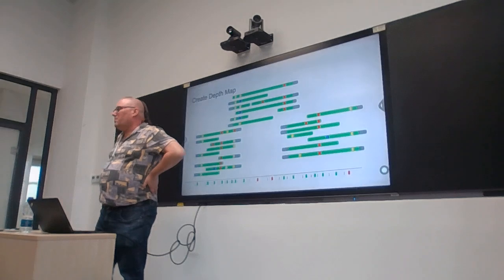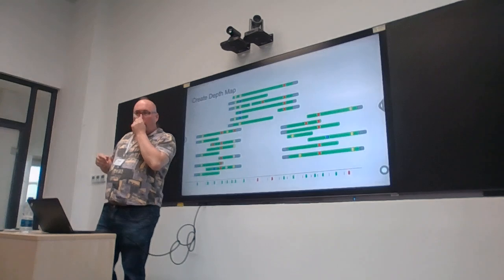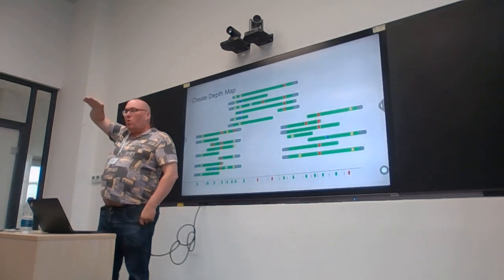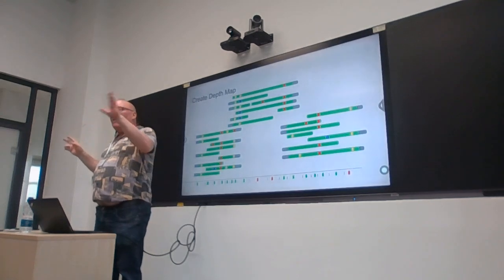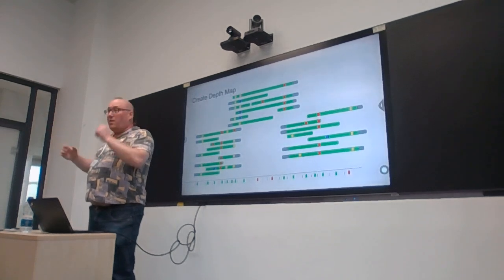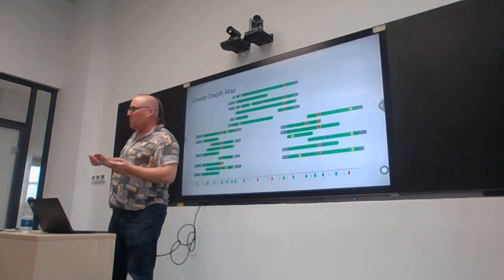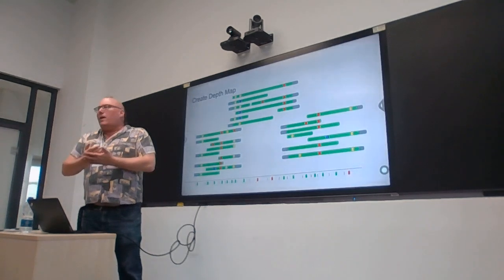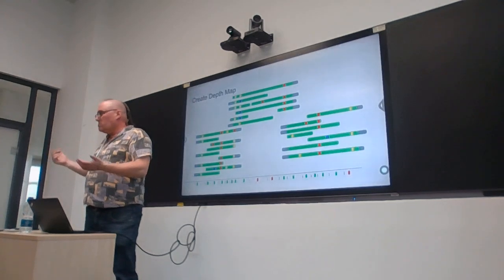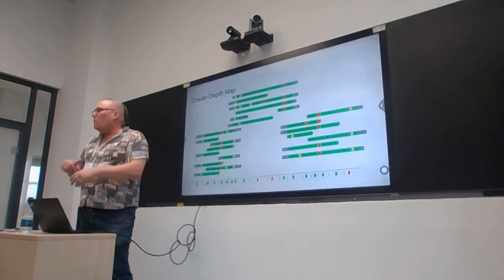Lab contamination. If you're sequencing lots of samples and then you find one where there's a whole lot of what I call bimodal, in other words, some of the variants are 80%, some are 20%, then more often than not, I worry that you are doing a batch and you had some DNA left over from the previous run, or maybe the fume hood wasn't cleaned quite well enough, or something like that has happened.